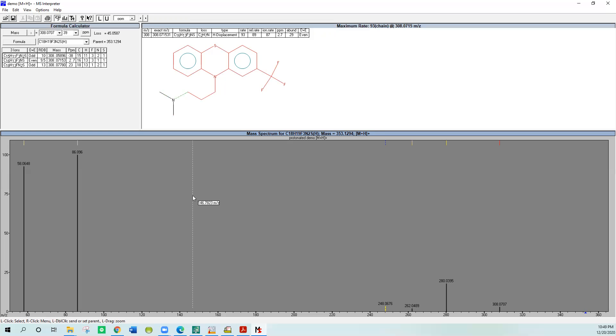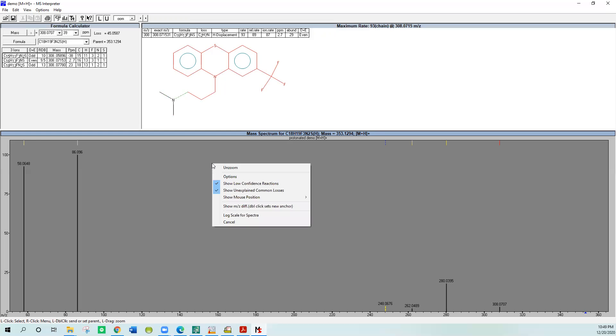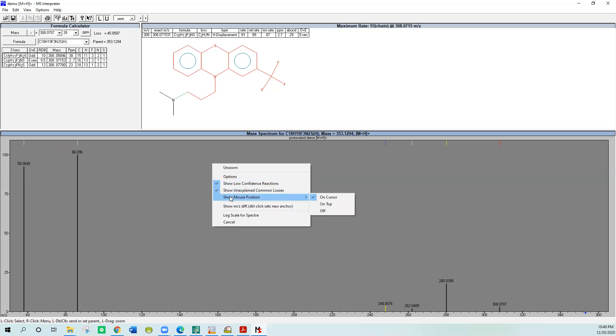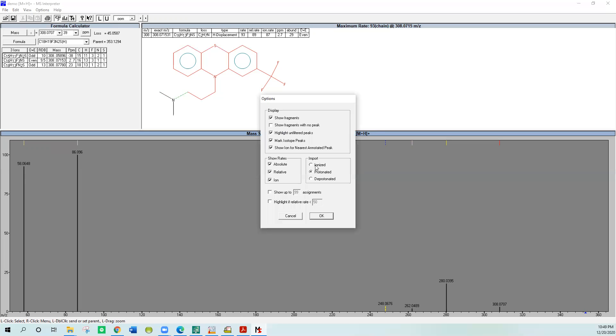The other thing you need to make sure to do is right click on the gray window and say options. You can see there's lots of different things you can select, and you just have to play with them. Show low confidence reactions, show unexplained common losses. I like to click show mouse position and put it on the cursor so that when you're on something it tells you where you're at. The other thing is you need to go to the options and select the type of ions you want. You want to protonate it when you import it if you're doing M plus H. Deprotonated would be M minus H, and then you'd also have ionized if it was an EI type spectrum.